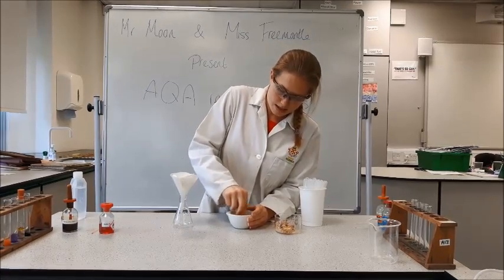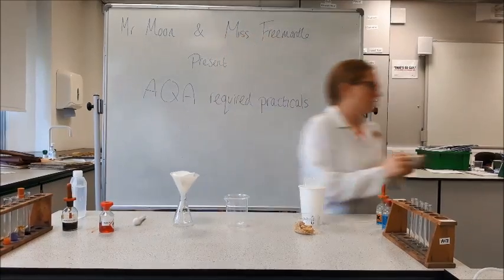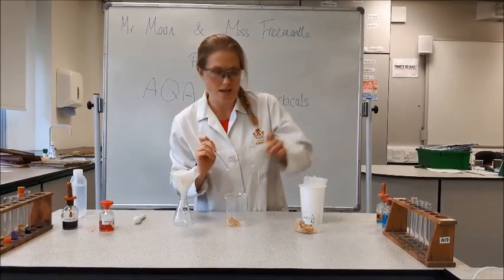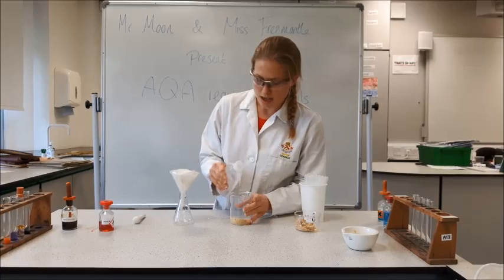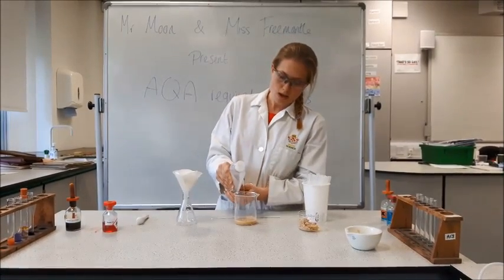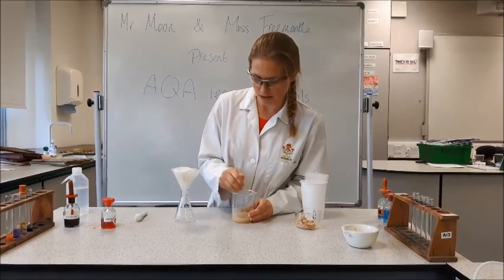We've got a nice ground-up powder there. I'm going to add this into a beaker — you can use a 100ml or 250ml beaker, it doesn't really matter. To this I'm going to add some distilled water, which will hopefully dissolve any protein, glucose or reducing sugars, and any starch that the biscuit contains. Now I'm going to give it a really good mix to help the dissolving along.